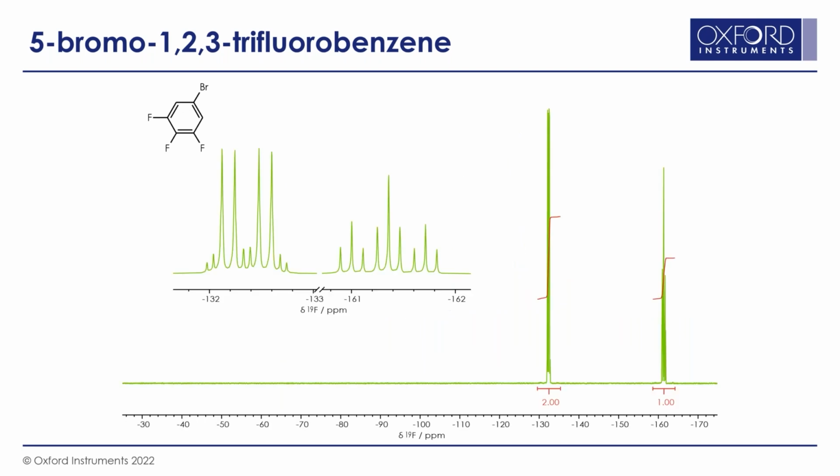On the X-Pulse, as with most high field systems, the proton channel is also able to observe fluorine due to the similarities in their frequencies. While most signals in a proton NMR spectrum fall within a 20 ppm range, fluorine-19 NMR spectroscopy requires a much larger spectral window, with signals commonly observed over a range of +100 to -250 ppm, relative to trichlorofluoromethane.